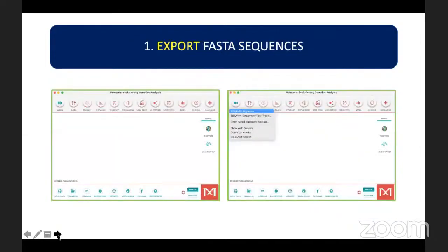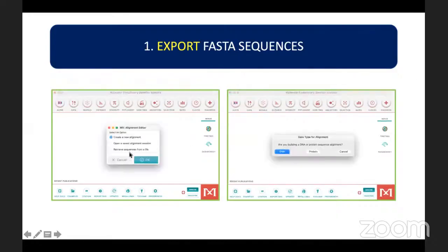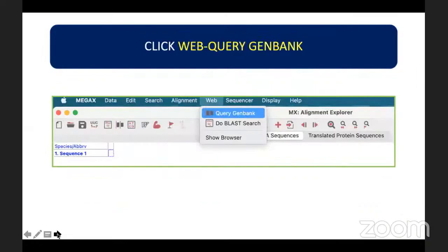For the first step, to export FASTA sequences into the MEGA X software, click on the Align button and then Edit/Build Alignment. Then create a new alignment and choose the type of molecule — in this case we are dealing with DNA sequences, so click DNA. In order to add new sequences using the accession numbers of the organism under study, click Web and Query GenBank.